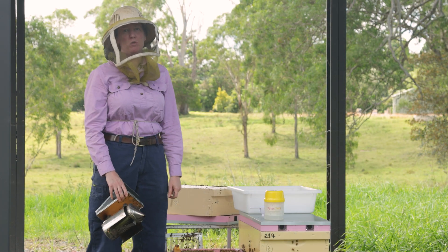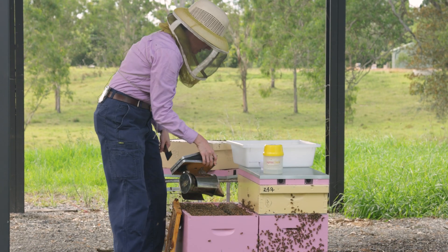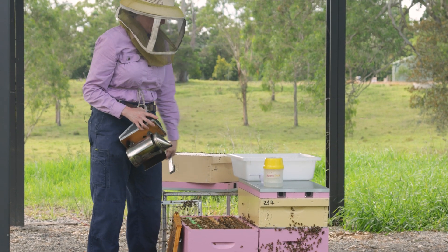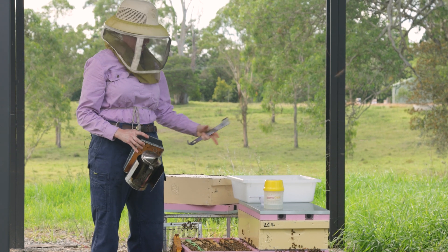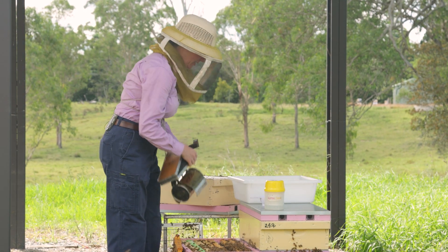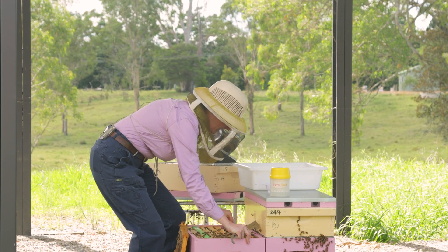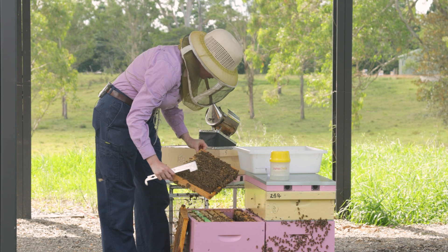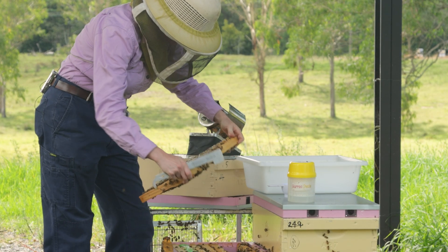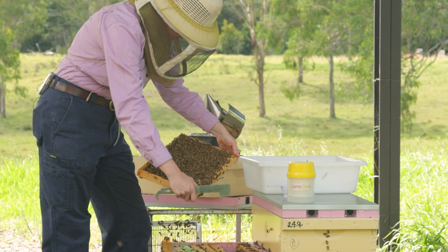We'll conduct a soapy water wash to monitor varroa mites. We've already smoked our hive and taken any supers off that don't have brood to go directly down into the brood nest — the area of the hive that has brood frames — because that is where we'll take our sample of bees from, seeing as varroa is most highly present in the brood nest. We want a frame that's got a mix of open and capped brood, and this one will do us just fine.